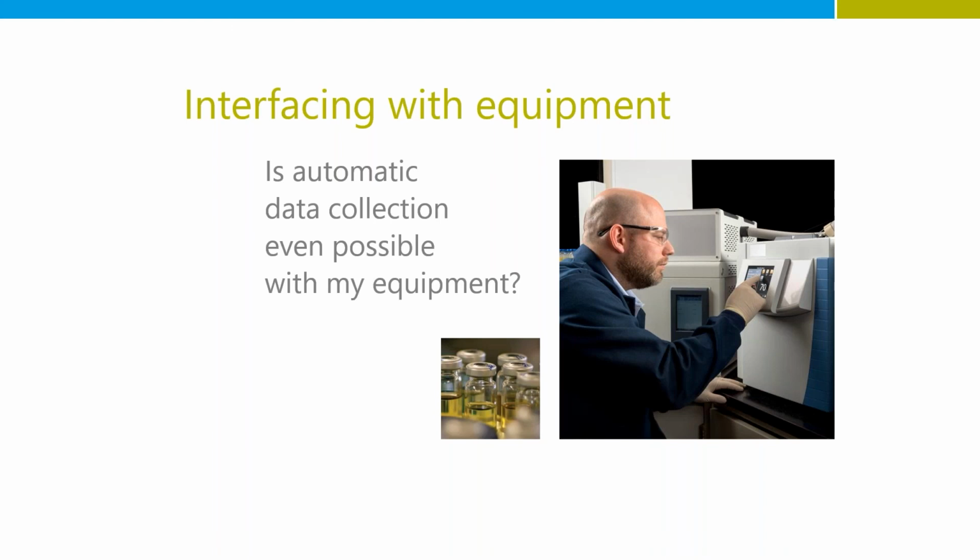Sure, that's a great question. And automatic data collection is where you want to head. The less, as Bill had mentioned, the less you have to touch the data, rekey it, review it, the better. So you want to endeavor to get that information flowing through your systems as autonomously as possible.